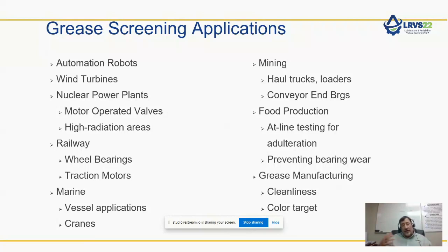And again, it's a very quick turnaround type of process, because once that locomotive comes in for maintenance, you don't have a lot of time to sit for samples to be sent off and to make their way back again days later. It's too late then. The locomotive already has a bunch of cars attached to it, and it's out on the track somewhere. We need that quick turnaround, and this on-site, at-machine screening tool can do that for us.